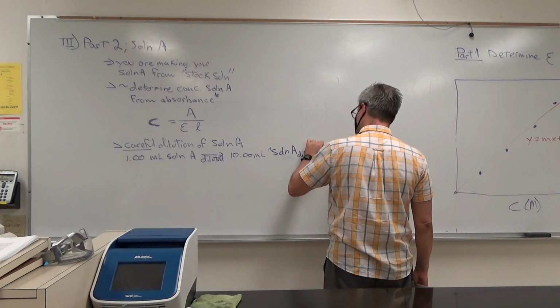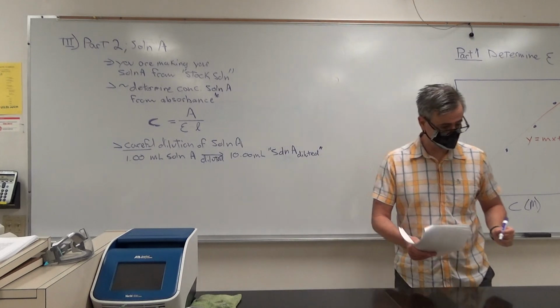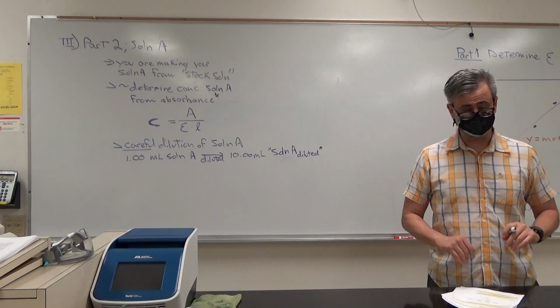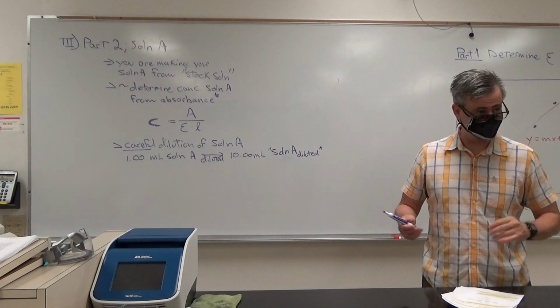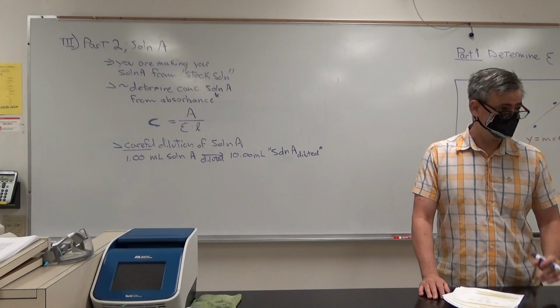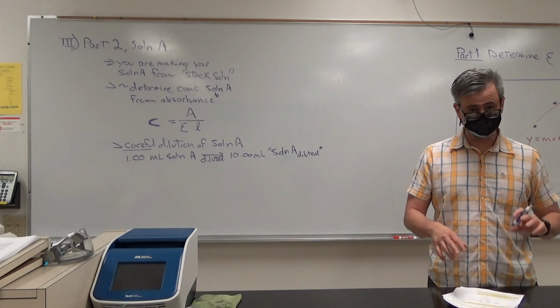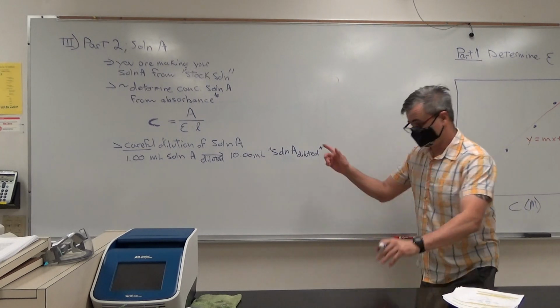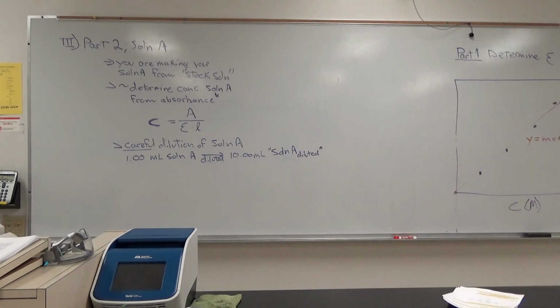Today, by the way, is a good time to use one of my favorite lessons for working in a lab. Label, label, label. Label everything. It's all purple. Not just the pen, but methyl violet is violet color. It's purple. So you won't remember. So make sure you label everything. Okay? All right. You're going to do that with volumetric flask. These are 10 ml volumetric flasks right here.